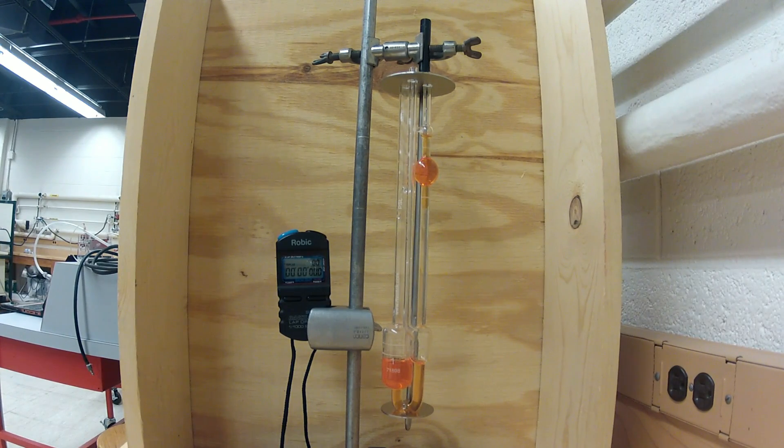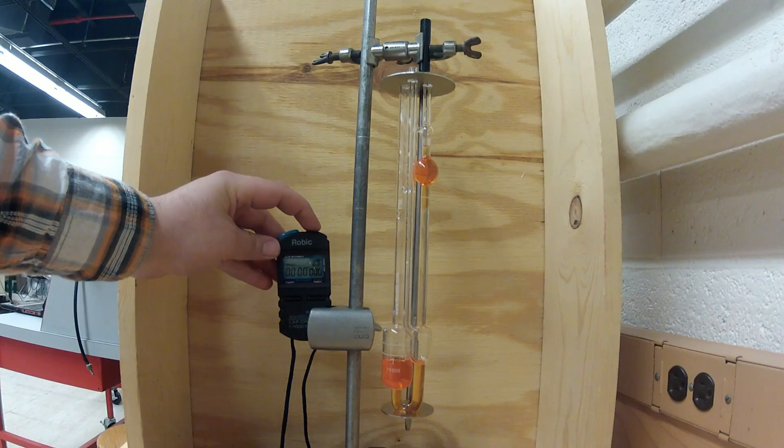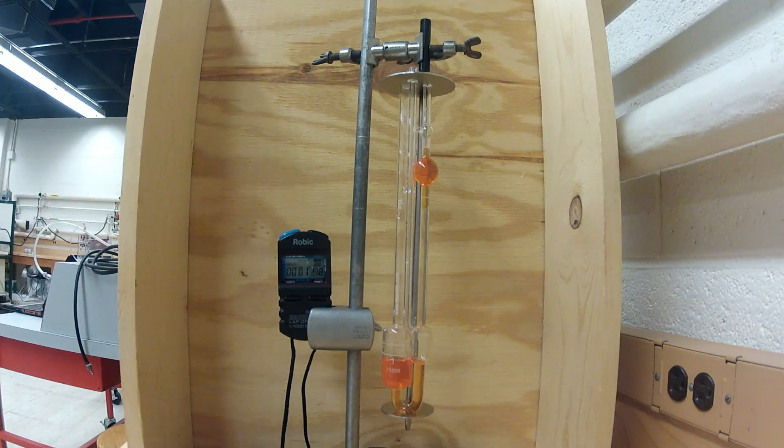You'll want to start the timer once the bottom of the meniscus of the test fluid crosses line M1, the upper line of the viscometer, as shown here. You'll want to measure the efflux time — the time it takes the fluid to fall from M1 to M2 of the viscometer.